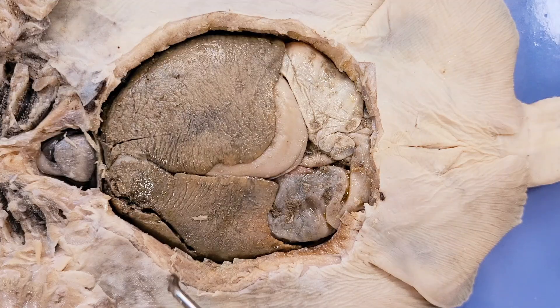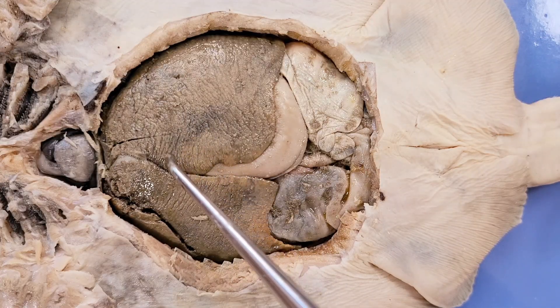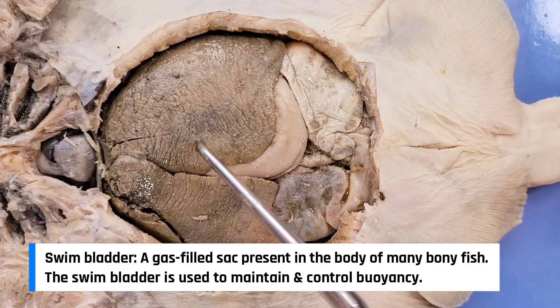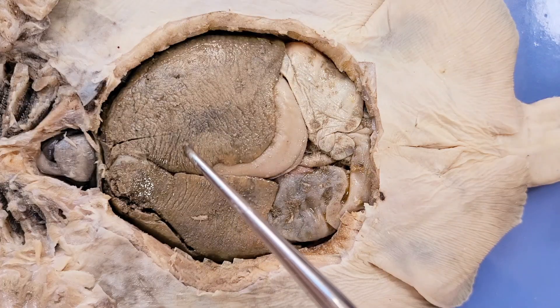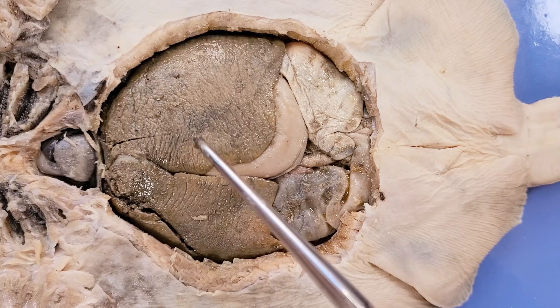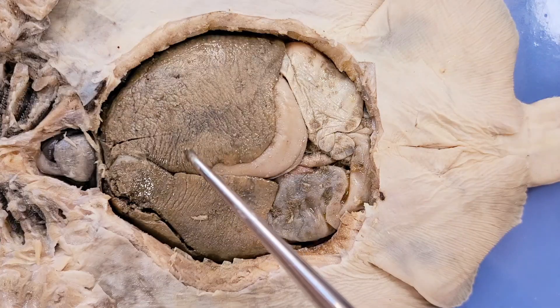Storing energy and fatty reserves in the liver also serves another function in skates. Skates, just like sharks, don't have a swim bladder, which means it's harder for them to keep buoyant. One of the ways they compensate for this is by concentrating and storing a lot of oil in this liver right here. Oil is less dense than water — just think of how oil floats on water — so it helps the skate maintain its buoyancy.